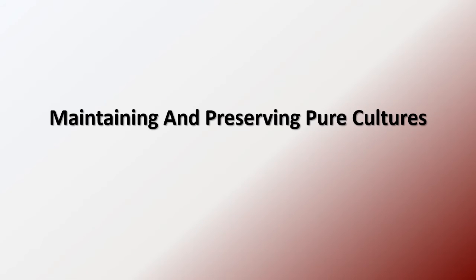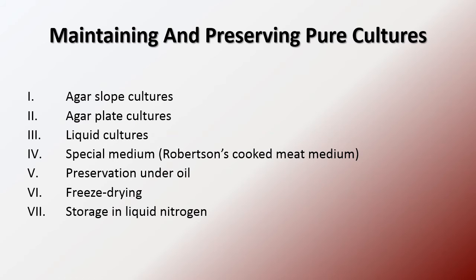The following lectures will be on maintaining and preserving pure cultures. So why do we have to maintain and preserve a pure culture? The reason is to have a sustainable supply of pure cultures, either for industrial purposes or for research. There are various ways you can maintain and preserve a pure culture. So let's look at them one by one.